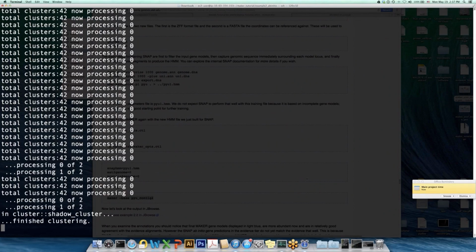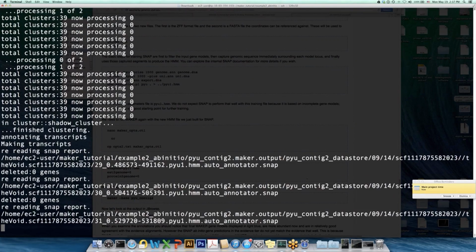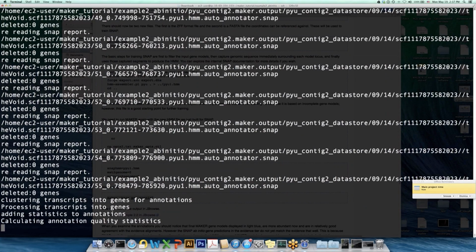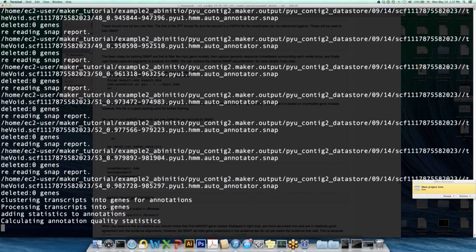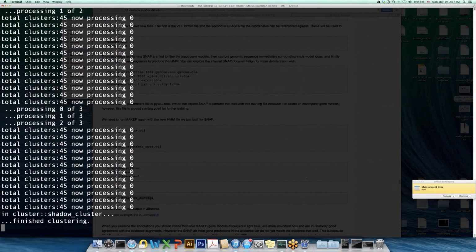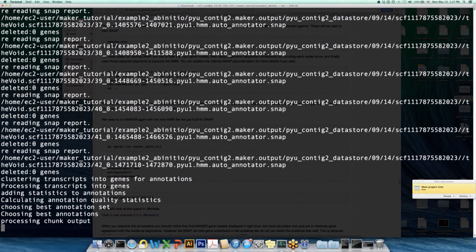In general, you need at least 10 megabases of sequence in many genomes to get enough genes, because you need maybe 400 to 500 genes to train with. But some genomes, like fungi or genomes with higher gene density, you might be able to train in just a couple of contigs that are maybe a couple of megabases in length. And you don't need to train on the entire genome. You can just take a small segment of the genome, call the genes on that, and then use that as the base for your training.